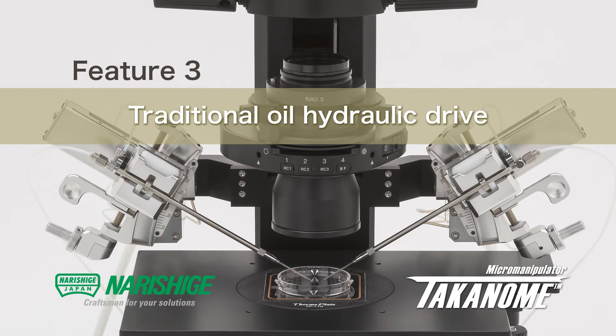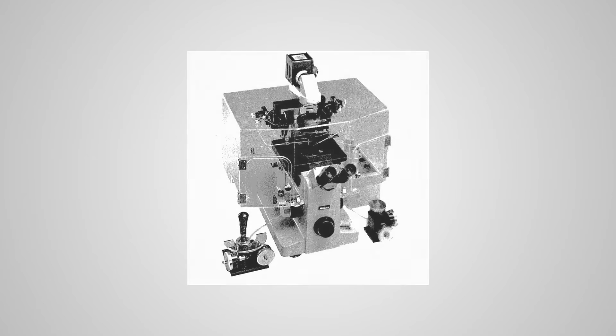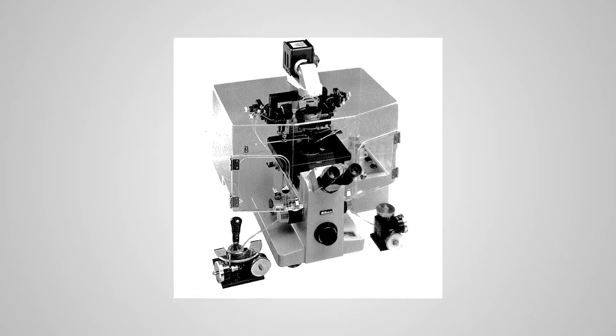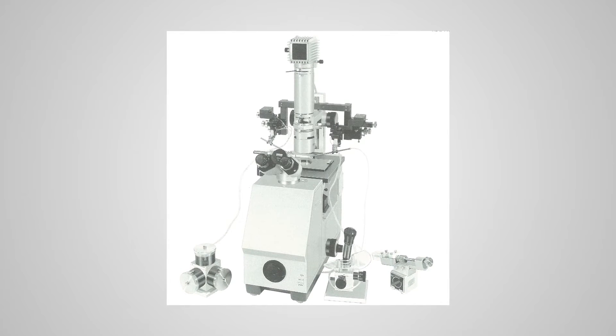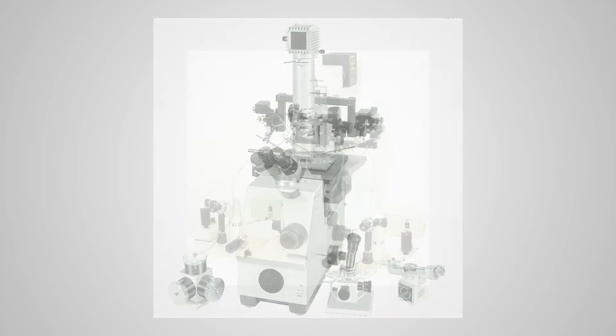Feature 3: traditional oil hydraulic drive. Narishige has a long history of relationship with our customers for smooth movement of oil hydraulic micro-manipulator.